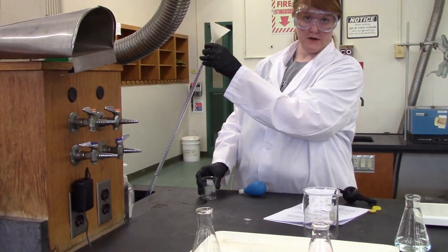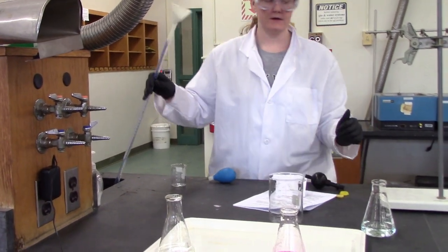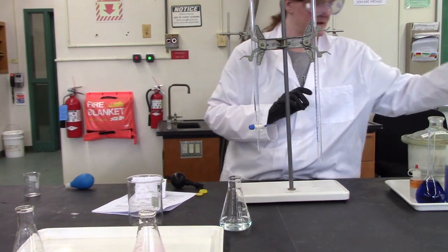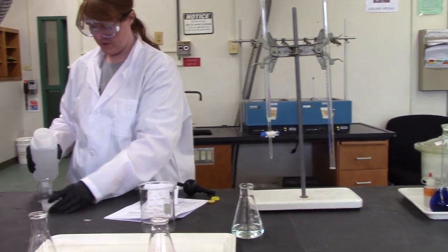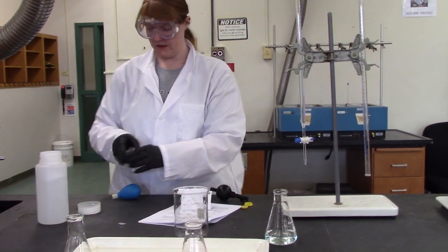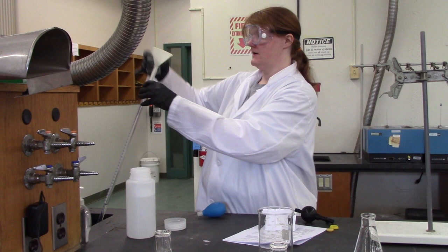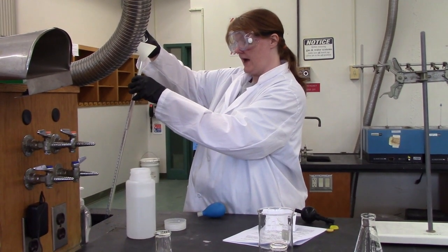Oh, the part I forgot, you should not do this, is I didn't tell you that I wrote down the measurement of where I was at, all right? So if you write down your measurement before you fill, and your new initial afterwards, then you can add the volumes together. Don't forget to do that. It may not be an issue for some of you because you might not need 50 milliliters or more, but if you do, stop before you get to the 50, write that volume down as part of the same run, and then you're gonna write your new, your second initial volume so that you can add the total together.